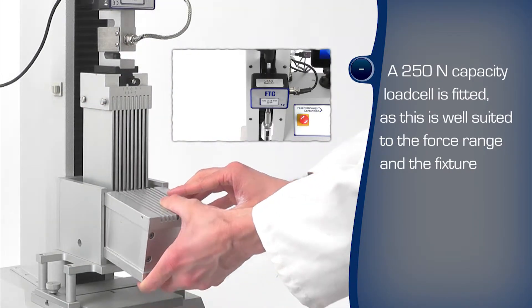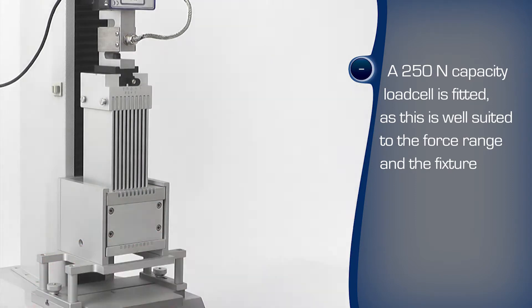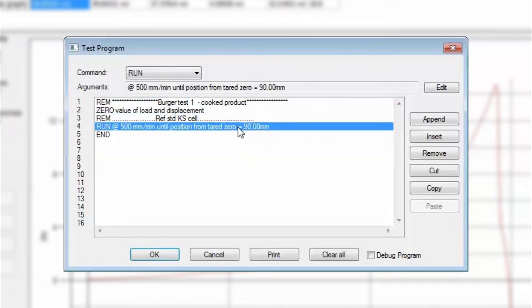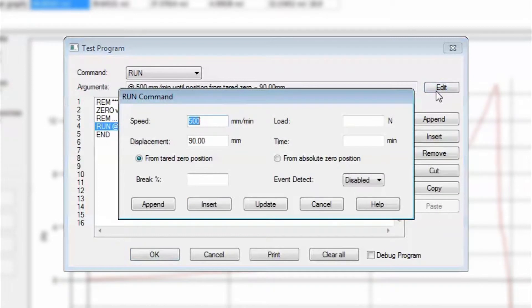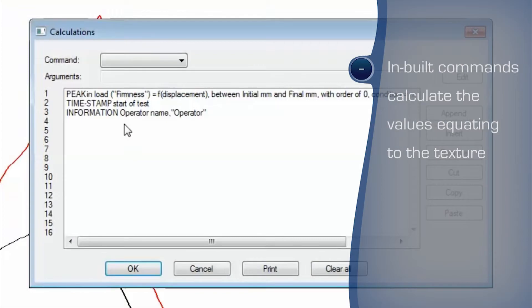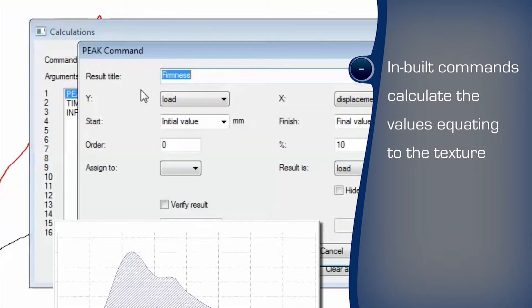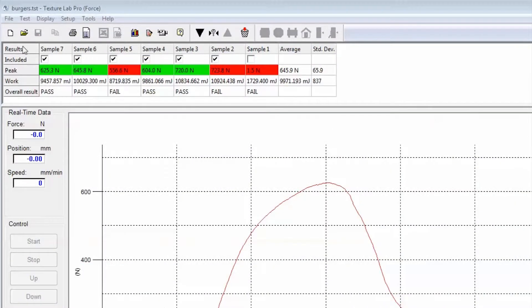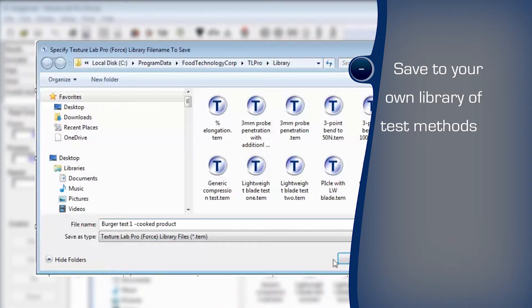A suitably rated load cell is used to maximise measurement accuracy. The automated test programme is easily written within the familiar Windows-based environment, where commands are selected to perform the steps. The burger's firmness is calculated from the peak force. Additionally, the work required to deform the sample is calculated from the area below the force-distance curve. These two values give greater information about the texture to more closely compare samples and provide feedback about the effectiveness of formulation changes. The programme can be saved to the library and recalled for reuse.